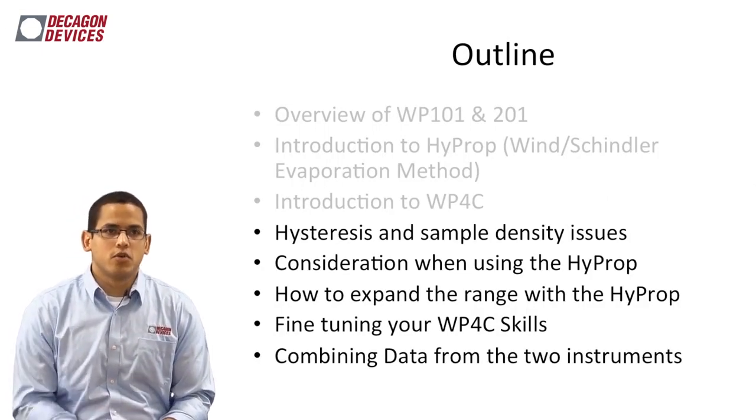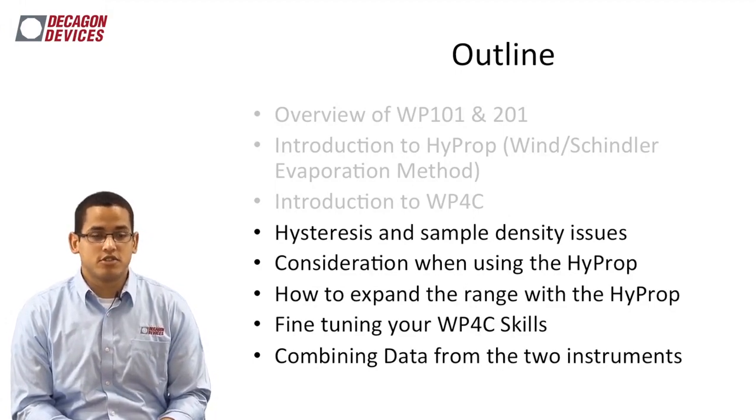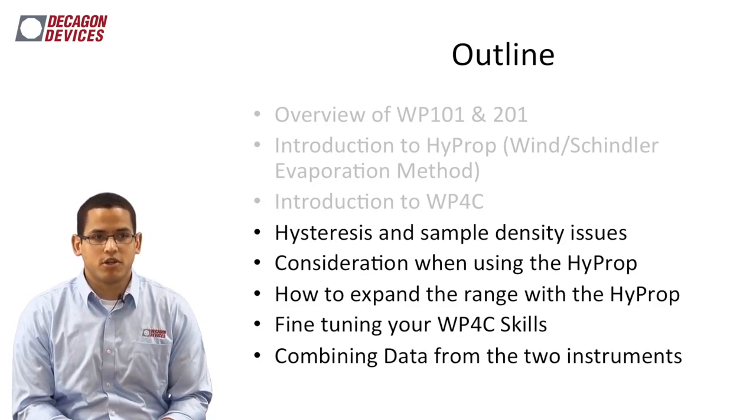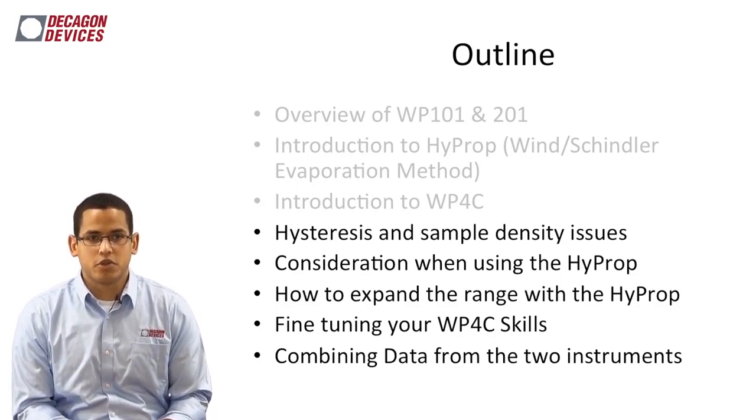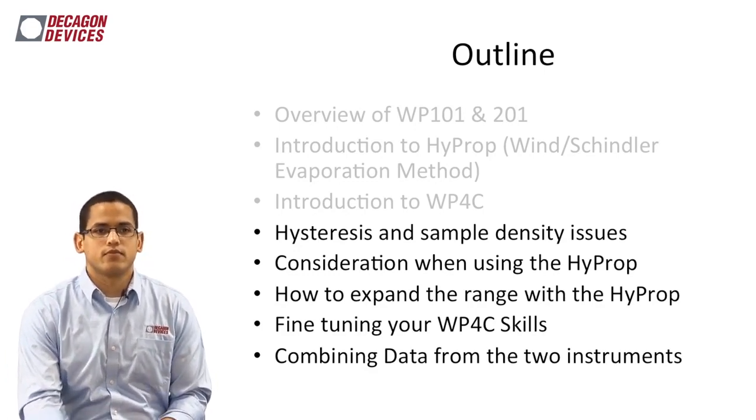Okay, so now we're going to go into some hysteresis and sample density issues. Talk about some considerations when using the HYPROP and how to expand the range with the HYPROP and fine-tuning your WP4C skills.